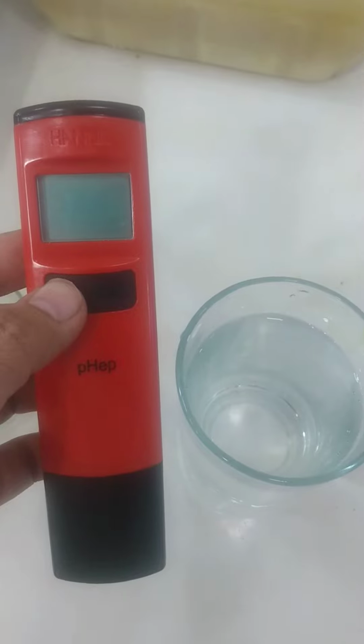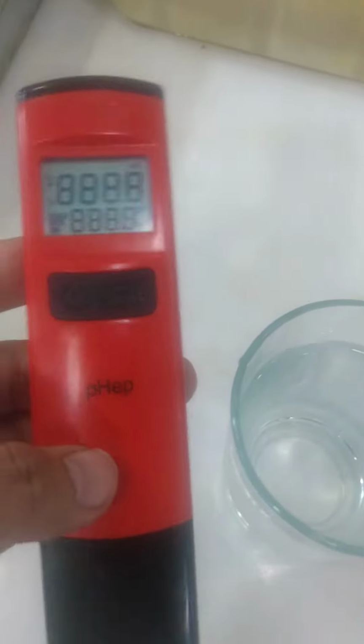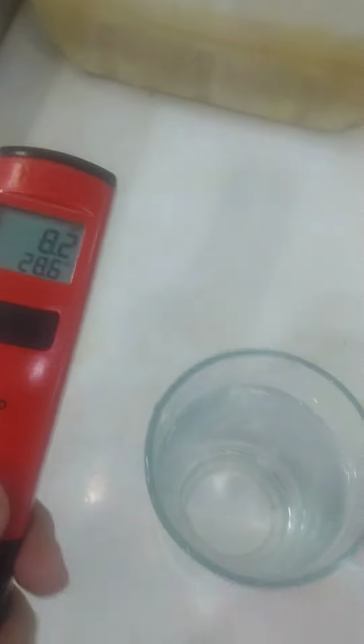Now we can check the pH meter. You have seen the Hanna pH meter, pH pen. First of all, open it: push this button and it opens. We take water into the glass, the same water that we took in the last video.